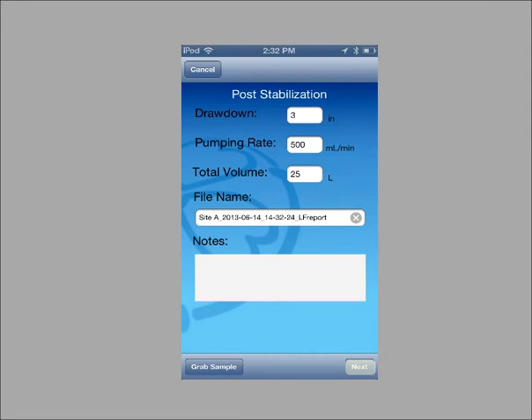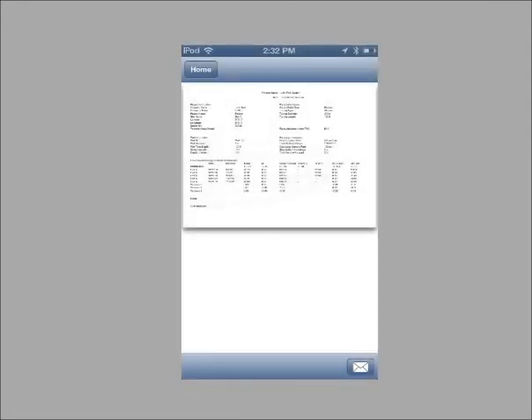You will see the test report that contains all of the site sampling information. You can pinch and drag to zoom in on the data.